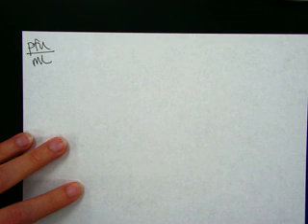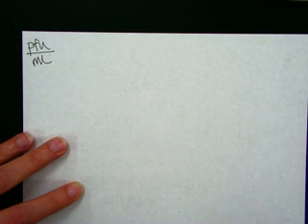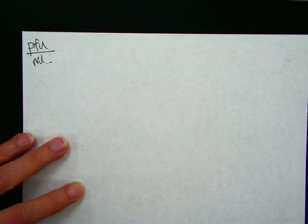So the vast majority of the time, a single plaque is caused by infection from a single phage. But a few times this does not happen, and multiple phages might stick together. Well, if they're sticking together to create one plaque, then they need to actually be counted as a single plaque forming unit. They're not going to come back apart. And so for that reason, we report plaque forming units per milliliter as a more accurate measure than phages per milliliter. Plus, we can actually see the plaques, and we can't see the phages.